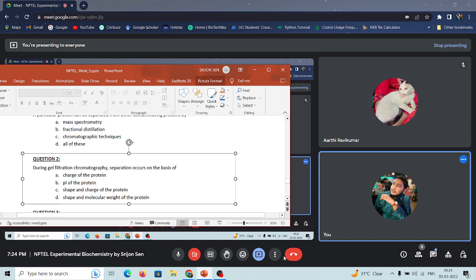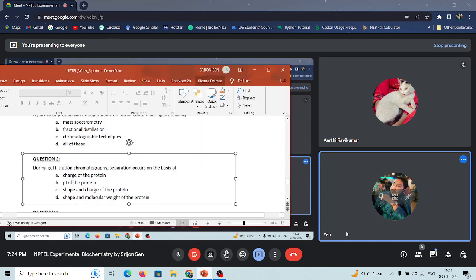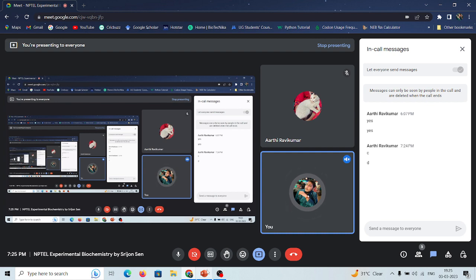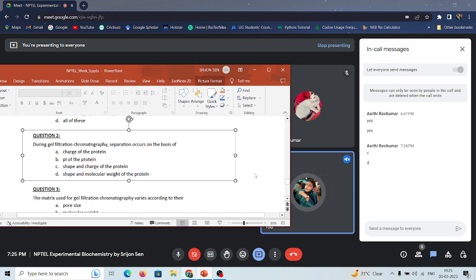Yes, so you have said D, that is right. When we perform gel filtration chromatography, or size exclusion chromatography, we separate based on the shape and the molecular weight of the protein. Now the next question. These are very easy questions.